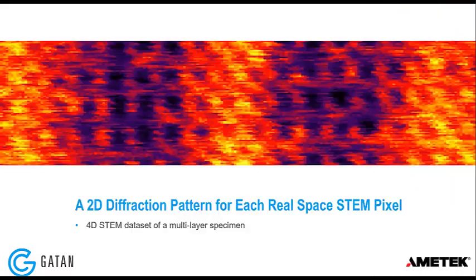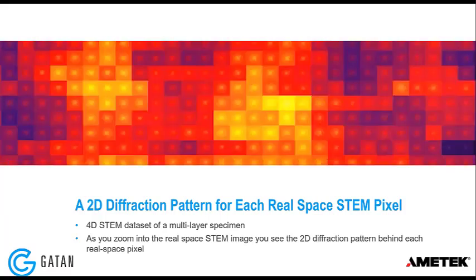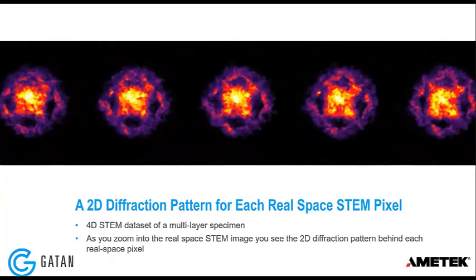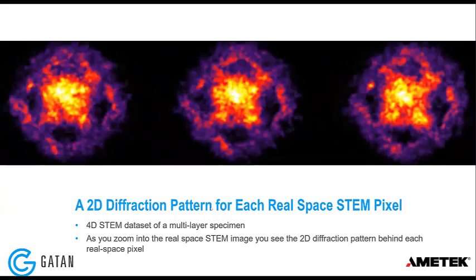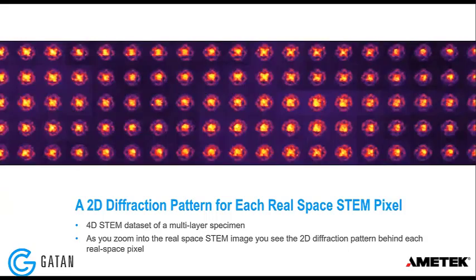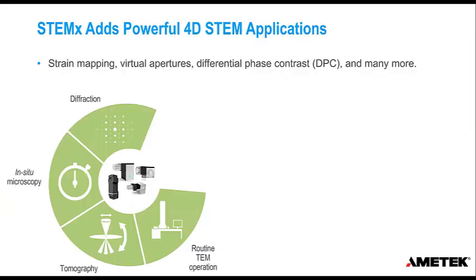So we talked about what 4D STEM is. As you saw during the experiments that Roberto just showed us very nicely, at each probe position in a two-dimensional scan, we collect a two-dimensional diffraction pattern, and that's why this is commonly now called a 4D STEM experiment. So you have 2 dimensions of diffraction and 2 dimensions scanning the sample.